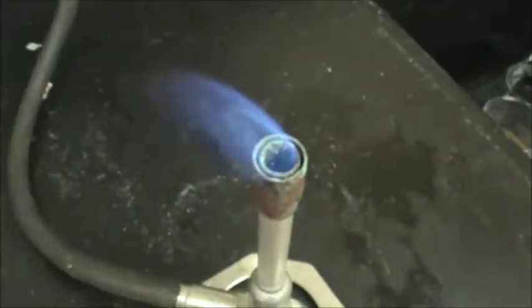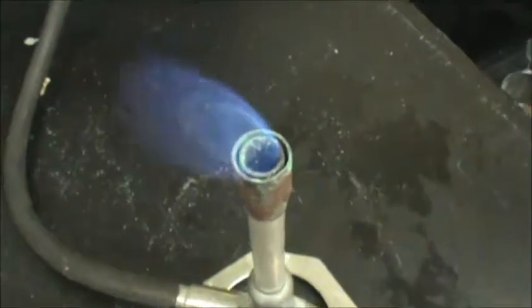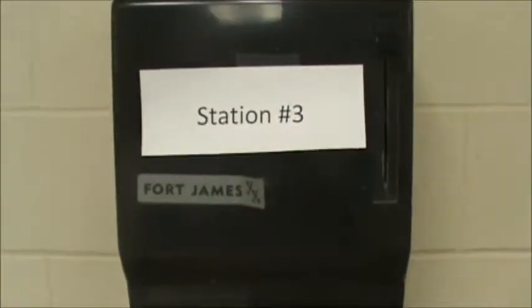We've got to keep in mind it did burn, so in order for things to burn, something else has to be present. So it wasn't just iron reacting in a flame, it was iron reacting in a flame with some other chemical that must be in the air. So big hint there. Alright, reaction number 3, station number 3.